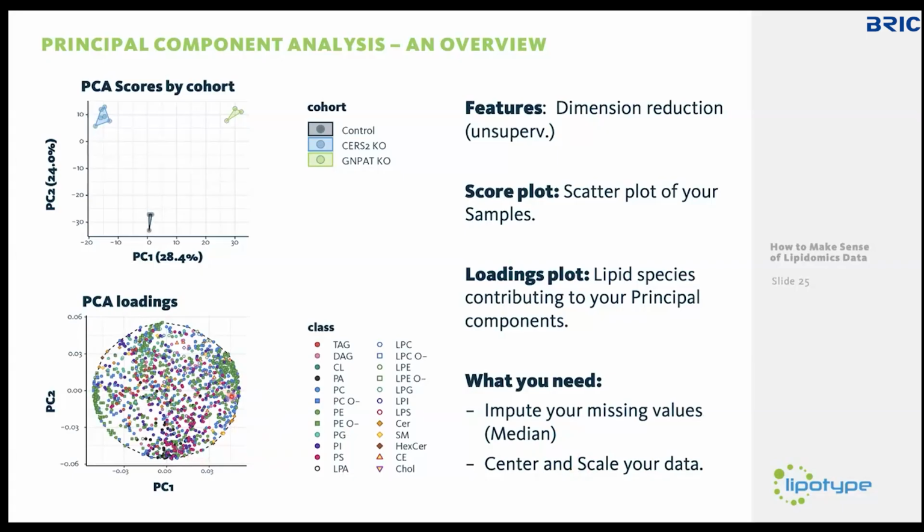If you, for example, have a plasma lipidome, you have a lot of lipid species with different abundance, but for example, cholesterol can be about 30% of lipids, so a major contribution. And then everything that you do in the PCA is usually skewed by the value of cholesterol. And you rather want to have a fine-grained contribution of all of your lipids.